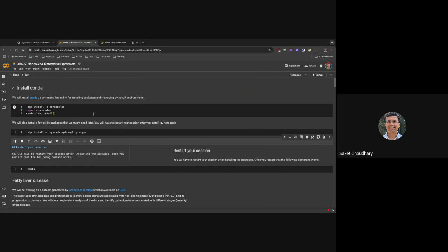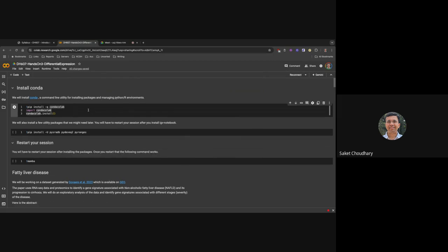Okay, so let's get started by doing the usual things. I try to keep this a mix of Python and R, and you'll see why R. My goal was that we could just do this in Python. Unfortunately, some of the bioinformatics ecosystem is still evolving in Python, and it will start to fail. We'll see just in a bit why that happens.